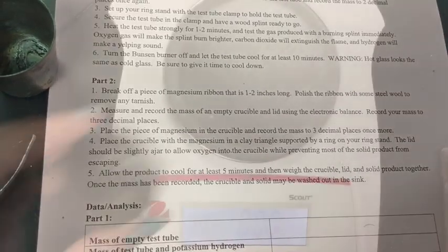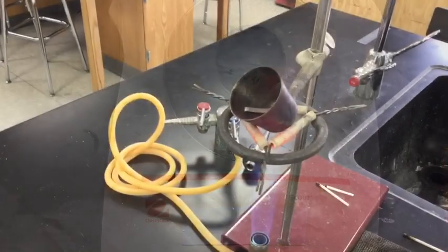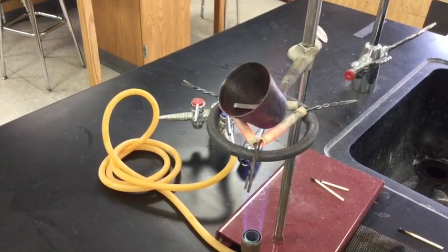We're going to weigh our crucible — that says 17.77 grams. And then when we put in our piece of magnesium, it weighs 17.85 grams. Now we are heating our crucible.